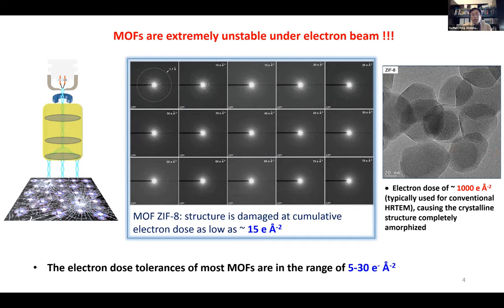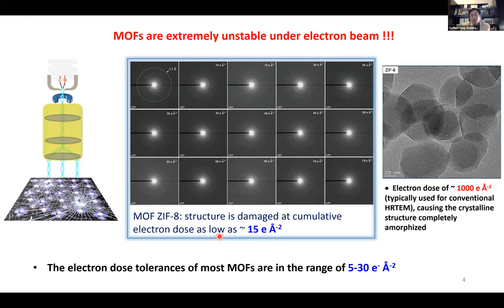To quantitatively understand the beam sensitivity of ZIF-8, we conducted electron diffraction experiments to monitor the structure evolution under electron beam irradiation. It turned out that when the cumulative electron dose reached as low as 15 electrons per square angstrom, structure damage occurs. This value is very low — about two orders of magnitude lower than the conventional electron dose used.